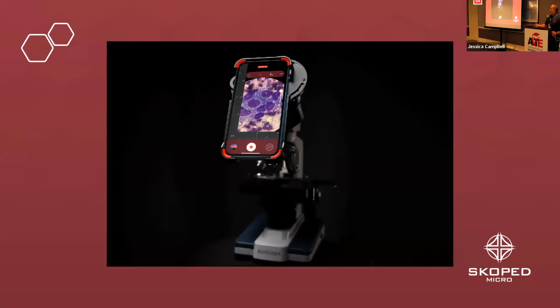Goes on the microscope, something like that. A lot of people do like it up and down. The app that we're going to talk about in a little bit is made to be up and down like this. Mine, I use vertical. My brain, I like it horizontal. We'll show you how that works later, but that's it. It's a case, and it's a microscope adapter.